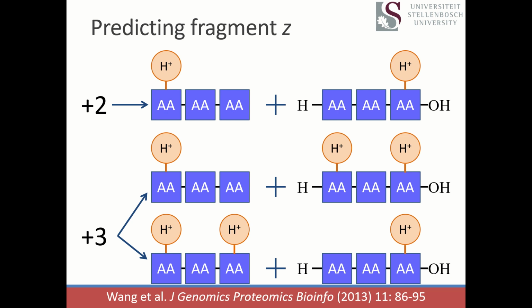In the case of a +1 or a +2 peptide ion, when it fragments, we anticipate that that one proton will go with each side, or in the case of a +1, that either it goes this way or it goes that way. In either case, you get a single +1 produced by that breakage. So if you were to predict a 10 amino acid peptide in say +2 form, how many different peptide bonds could you break? It's a trick question. 10 amino acids, how many peptide bonds connect them?